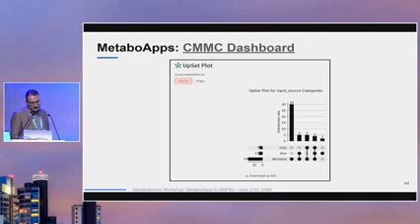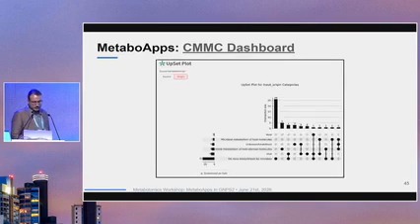And also you get the upset plot with the source, which in this case you're going to see the host diet and microbial correlations, or the origin, which in this case you're going to have the host microbial metabolism of food, some that are still undefined or unknown, so we don't have enough information on that. Then you have microbial metabolism of host-derived molecules, diet, and de novo biosynthesis.